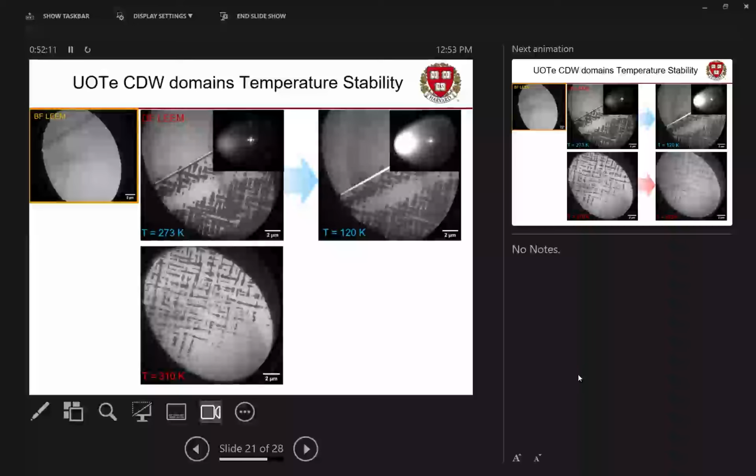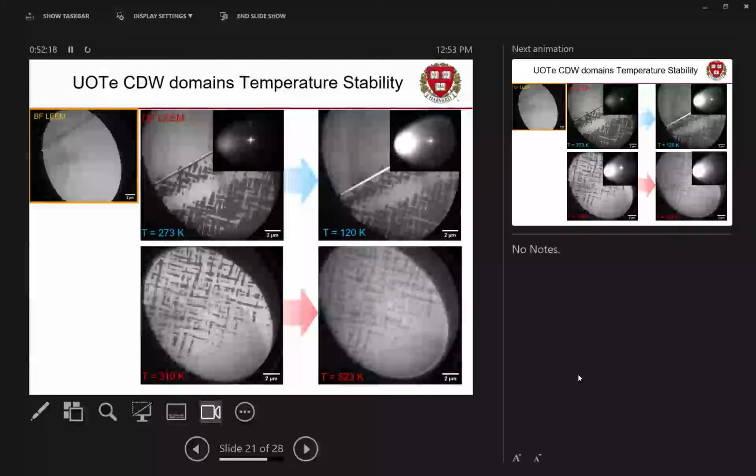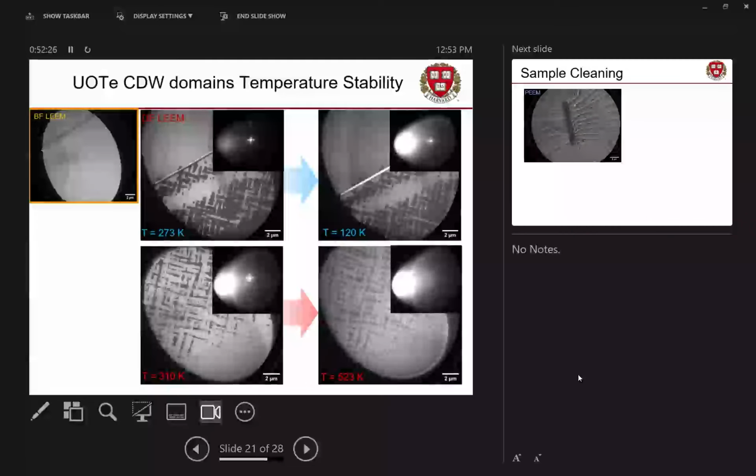How about hot? Again, another different area, 310 Kelvin. So, you know, warm, but not boiling. And here we are at 523 Kelvin or 250 Celsius. Still there, definitely fuzzier. Diffraction pattern still present, definitely fuzzy. This is around the temperature this material starts to actually decompose. The tellurium starts to sublime out or something and it stops being that material. But what this means is these patterns are present all the way from quite cold until the material literally comes apart in your hands. They're very robust.